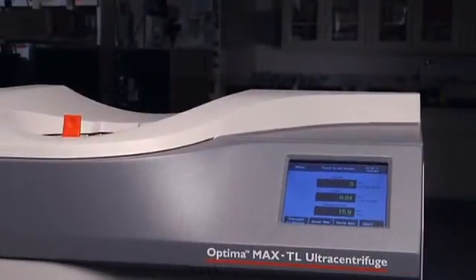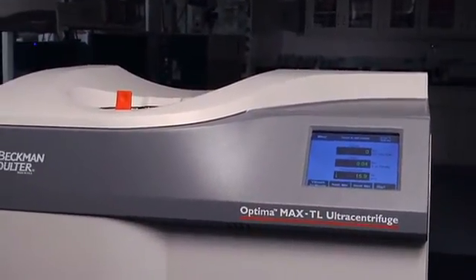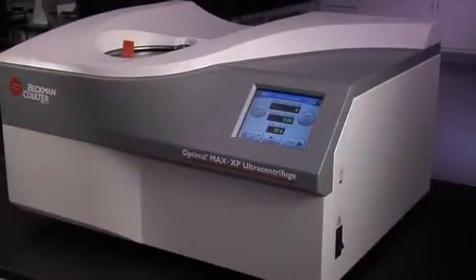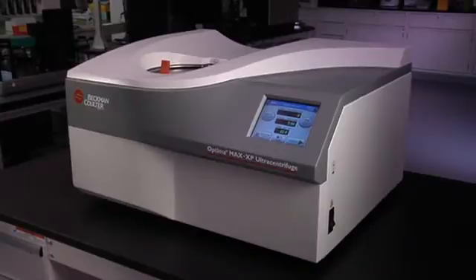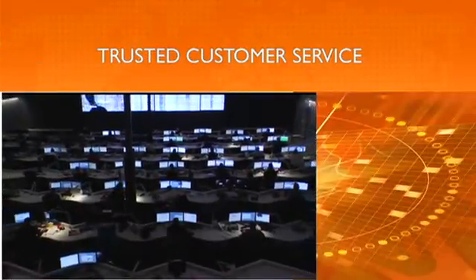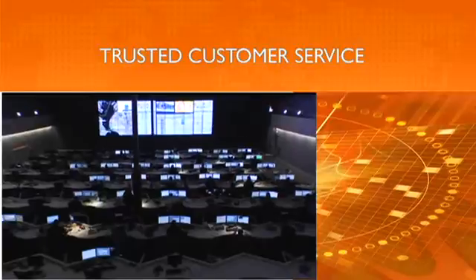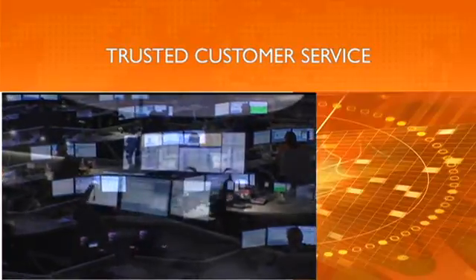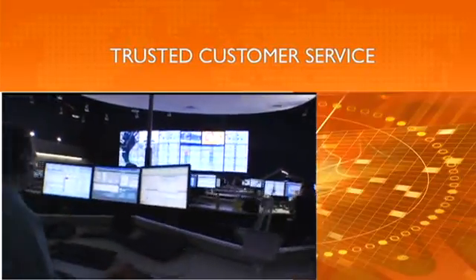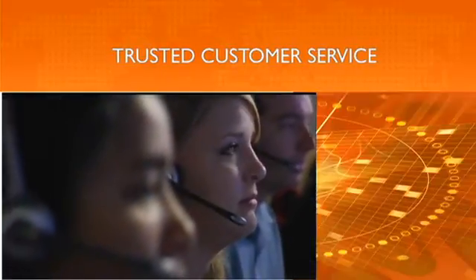Safety systems are as consistent as our instruments themselves. It's our commitment to keeping you and your samples safe and accurate. Plus, Beckman-Coulter has maintained an unwavering commitment to service excellence worldwide for more than 75 years. Our certified field service organization and knowledgeable customer service team can help you make the most of your system, from installation and training to post-sales hardware, software, and application support.